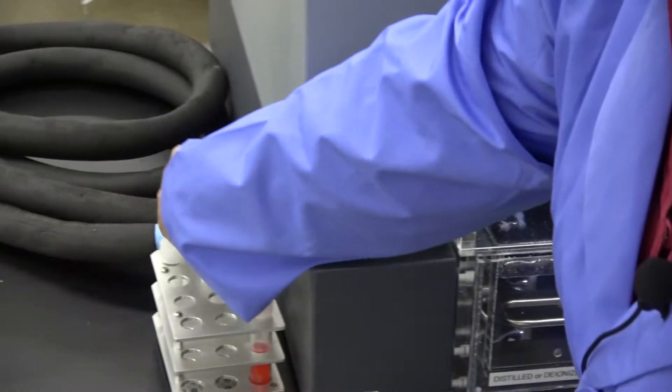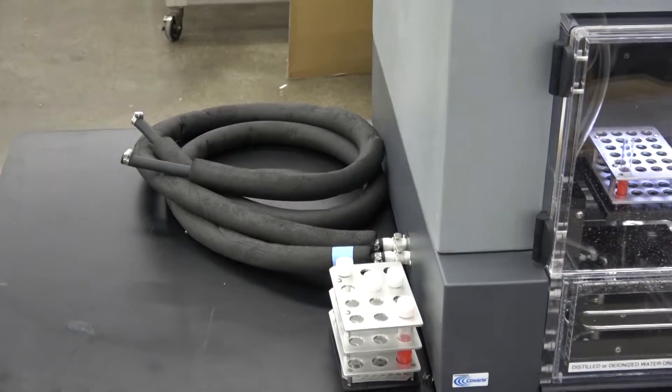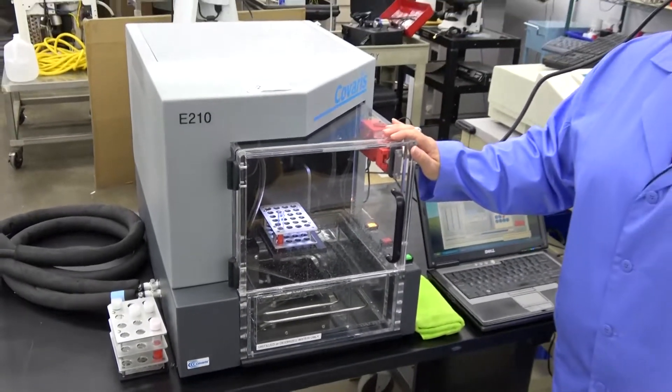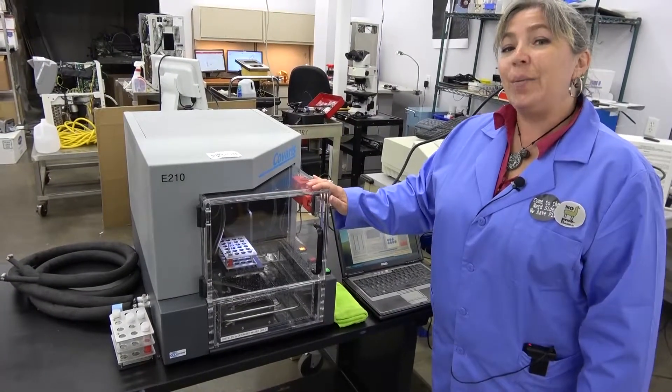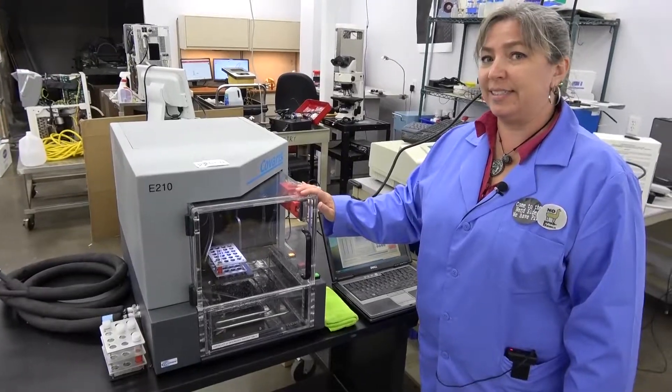It is all plumbed for a chiller recirculator. This item has been thoroughly tested by our in-house technicians. It is backed by our 90-day warranty, and we have it on hand currently in our Crowdersville, Ohio facility. Thank you very much.